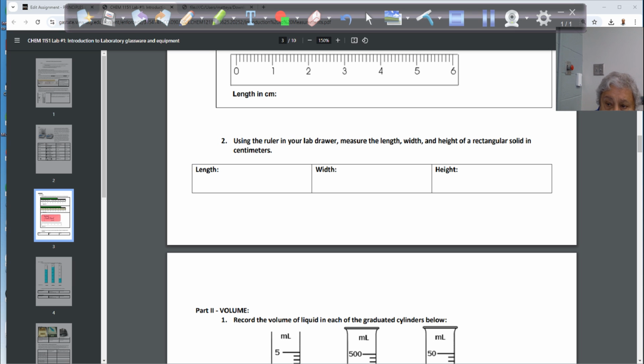You use it to measure the width, the length, and the height of a rectangular solid. So here it is. This is a rectangular solid. Look at this. This is my length. This is my height, up. And here is the y-axis, my depth or width. Depth or width. So, y-axis deep inside, depth. Up, that's the z-axis. This way, the flat one, length, x-axis.